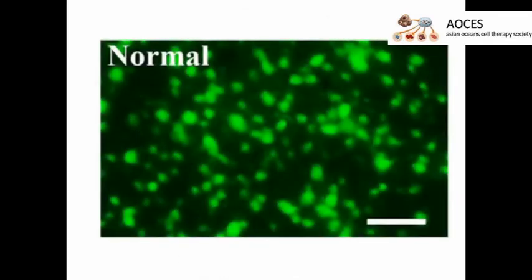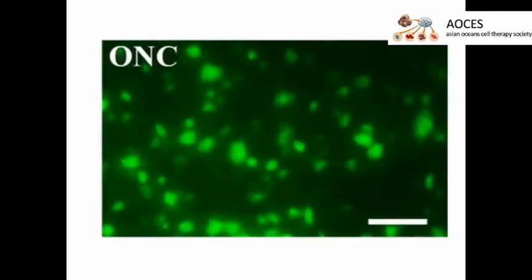This microscope image shows a fixed, flattened and mounted retina. This image shows the fluorogold labelled retinal ganglion cells before optic nerve crush injury in an uninjured, normal retina. The retinal ganglion cells have been retrogradely labelled with green fluorogold neural tracer dye injected into the superior colliculus. This image shows the fluorogold labelled retinal ganglion cells 7 days after the optic nerve crush injury. Compared with the previous image, the number of viable retinal ganglion cells is significantly lower in the retinae with an optic nerve crush injury.